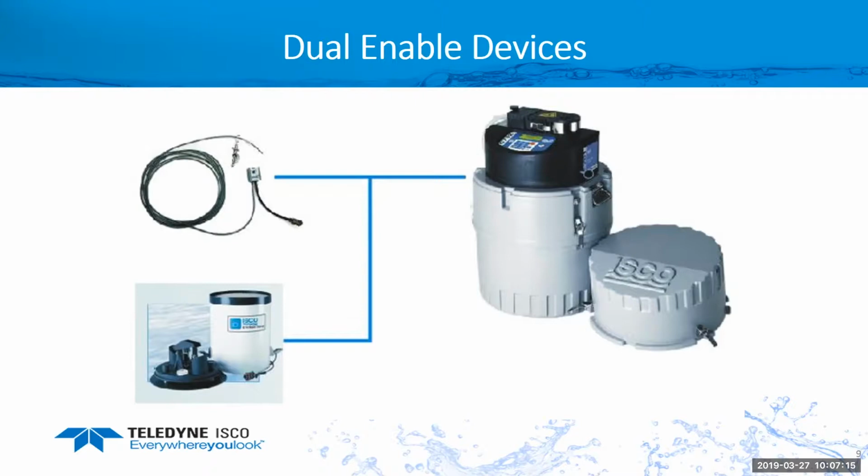strainer. So what the liquid level actuator does is it allows us to know that once the water hits it, we know we have enough water covering over the strainer so we can bring that water in and put it in the buckets.